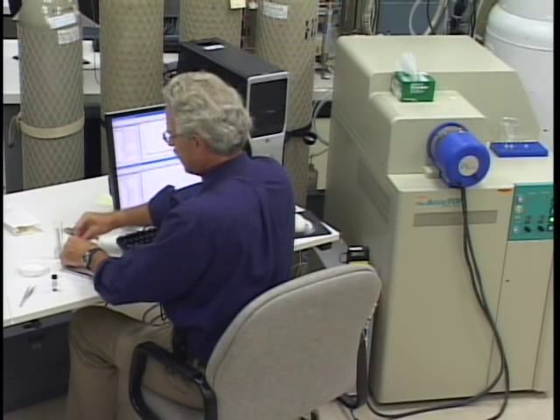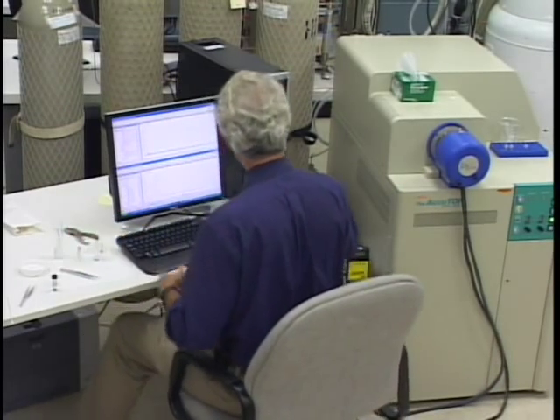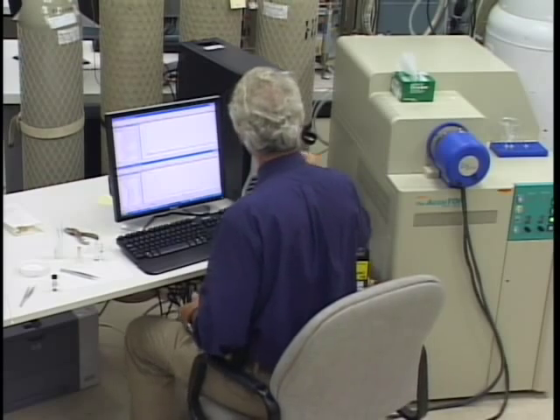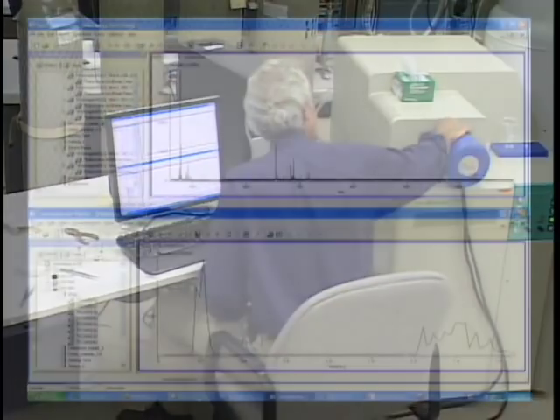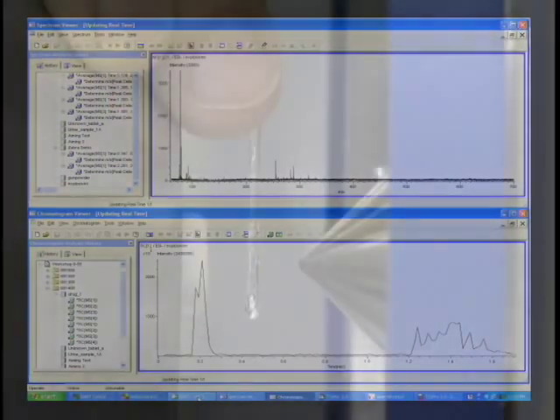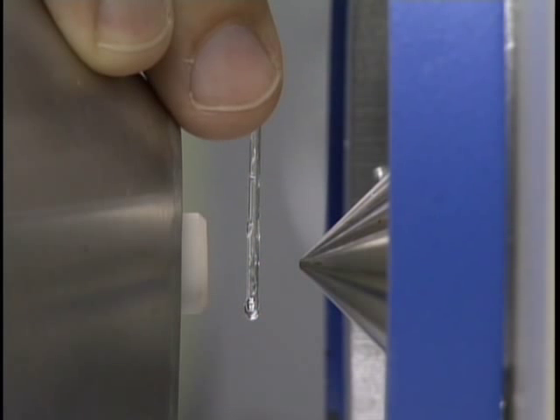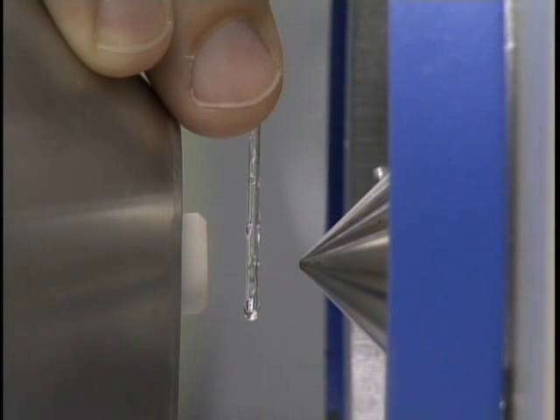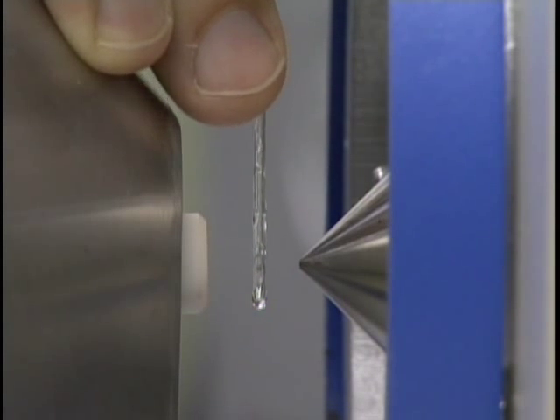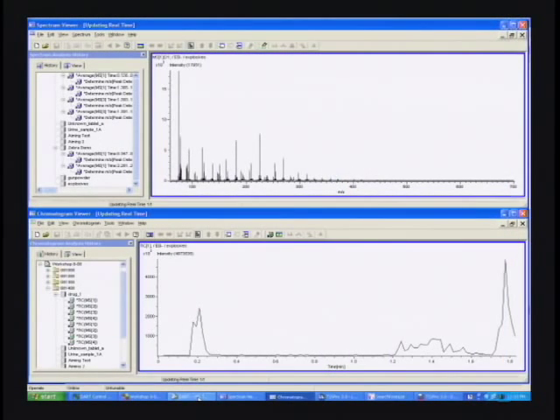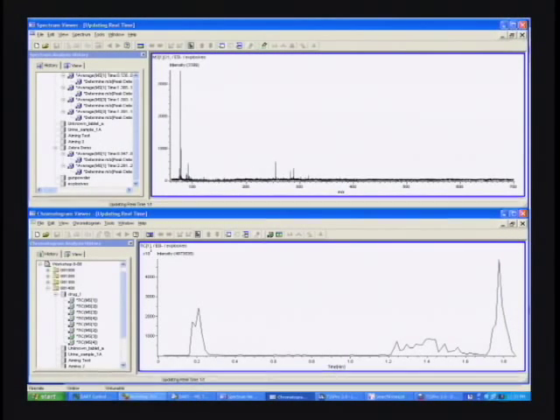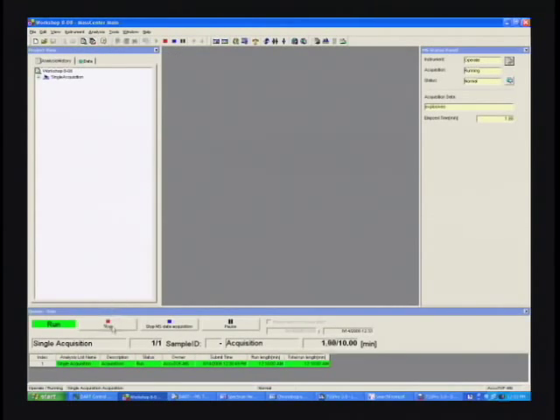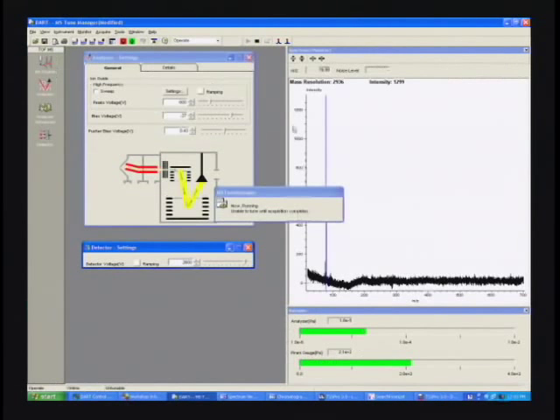Let's go ahead and throw some polyethylene glycol in the spectrum so that we have a reference compound. I'll put the top back on this. Here's our PEG negative ion spectrum. This tends to be oxygen adducts that are being formed from PEG in negative ion mode. That should be enough to calibrate on. We'll go ahead and close up the data file and put the dart back on standby.